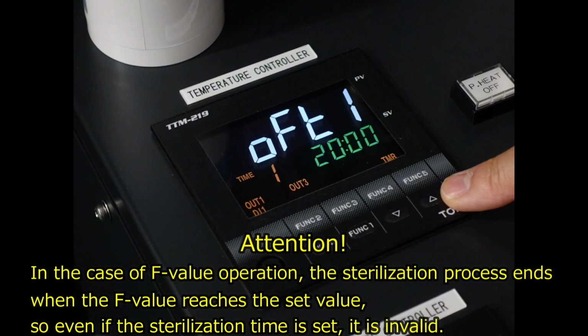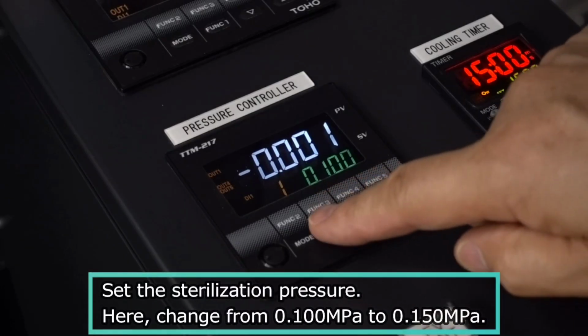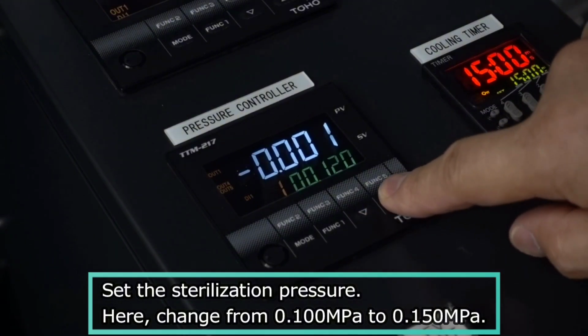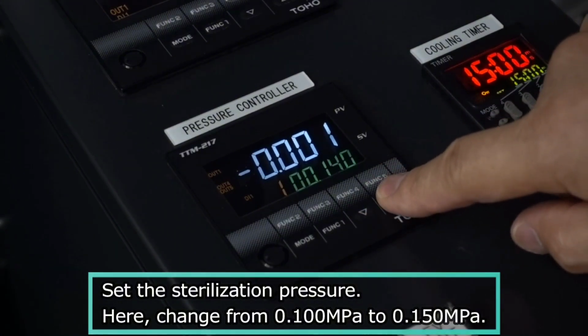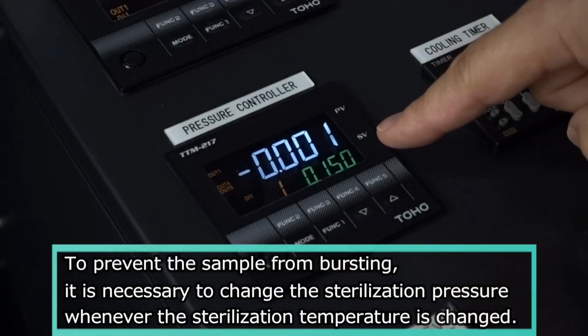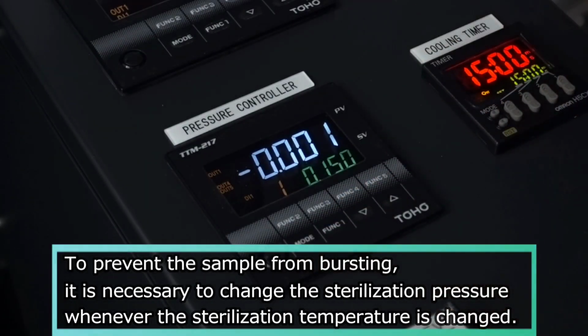Attention: in the case of F-value operation, the sterilization process ends when the F-value reaches the set value, so even if the sterilization time is set, it is invalid. Set the sterilization pressure. Here, change from 0.100 megapascals to 0.150 megapascals. To prevent the sample from bursting, it is necessary to change the sterilization pressure whenever the sterilization temperature is changed.